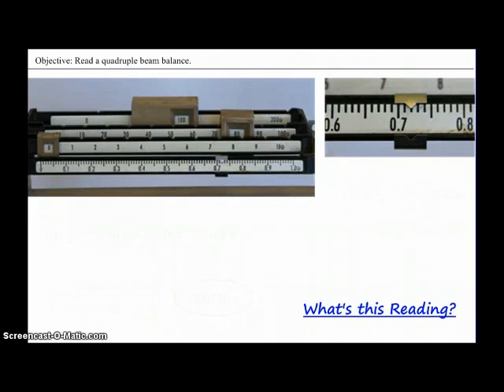Okay, let's go ahead and practice together on this reading. We can see when we take a look at the beam in the back that it has a reading of 100 grams. Our next beam has a reading of 80 grams. Our third beam has a reading of 0 grams. And our fourth beam has a reading of 0.7 grams.